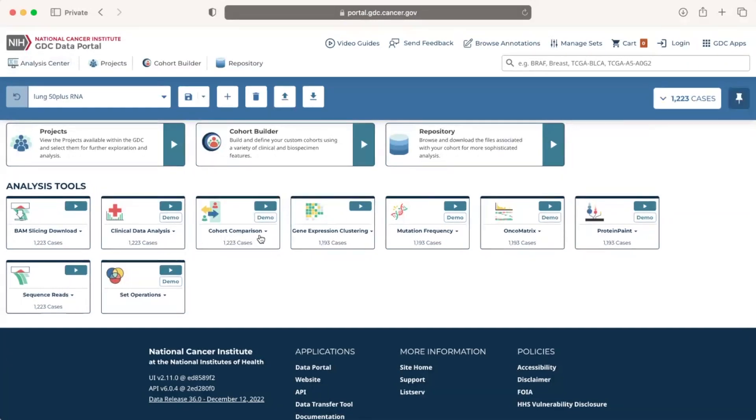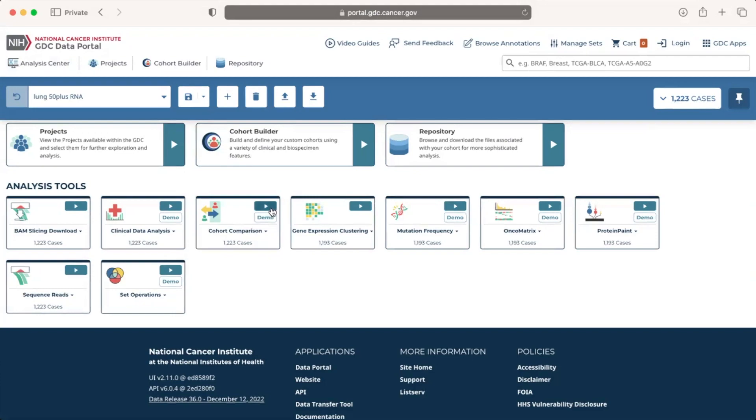Please note that the locations of the tool cards may change, so it is important to read the title of the cards. Once we have located the Cohort Comparison card, we will click on the play button in the upper right corner of the tile.